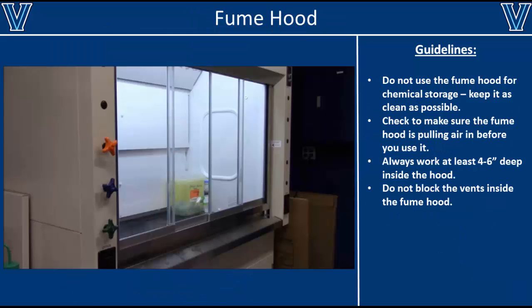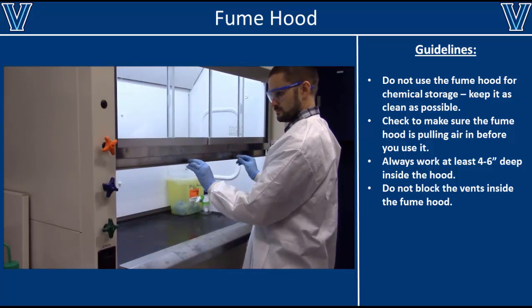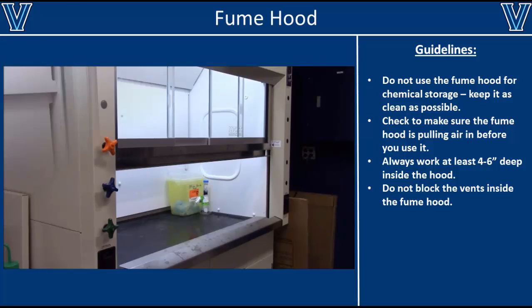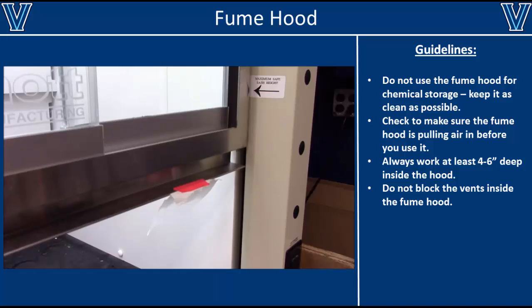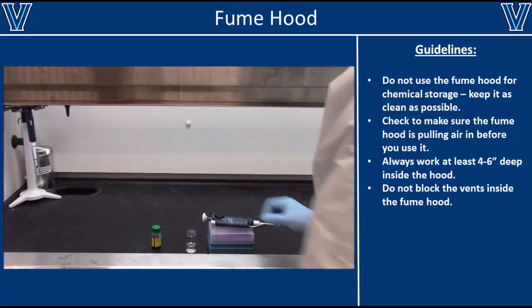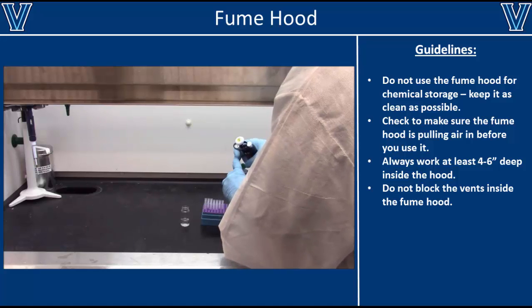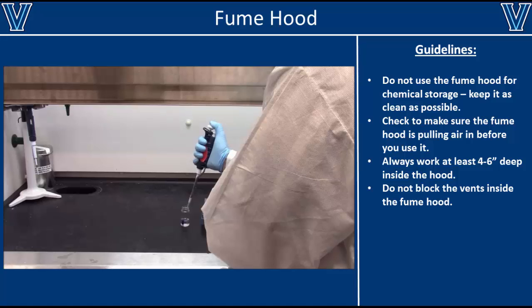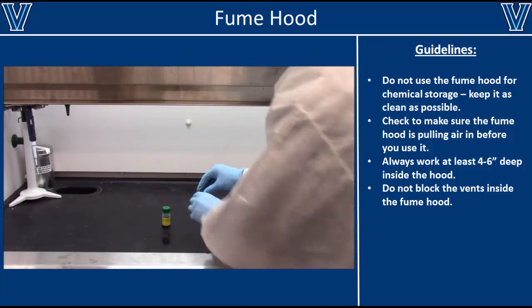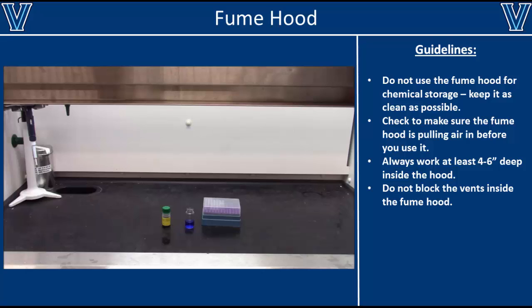If you work with any hazardous chemicals in your research, you will probably need to use the fume hood at some point. To begin working in the fume hood, raise the sash to the maximum safe height. Note that if you raise it too high, the fume hood will not work properly and some vapors may escape into the lab. When you raise the sash, it should start drawing air inwards. If there is no air flow or any alarms go off in the hood, let your supervisor know immediately and do not use the fume hood. When performing experiments in the fume hood, you should always work at least 6 inches deep. You should also keep the fume hood as clean and empty as possible to prevent hazardous chemicals from cross-reacting and to ensure the vents in the back remain unblocked. If these vents become blocked, the fume hood may lose suction and hazardous vapors may escape into the lab.